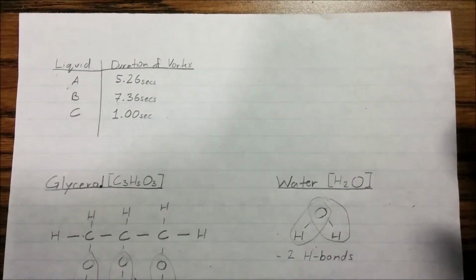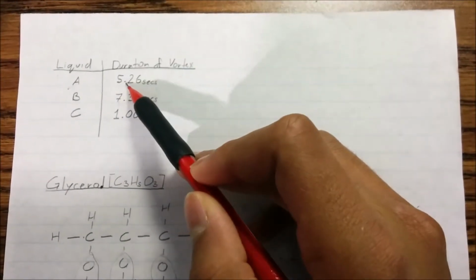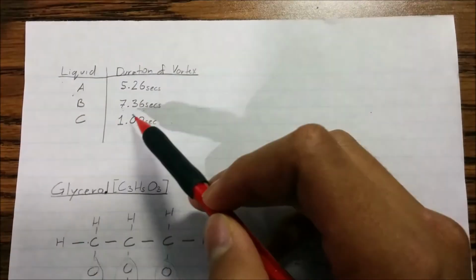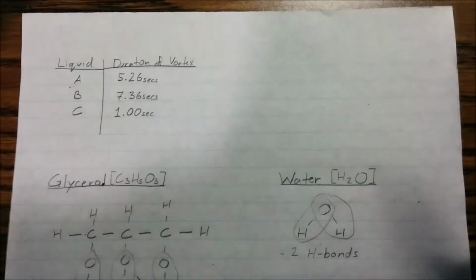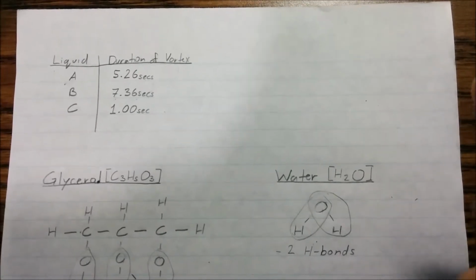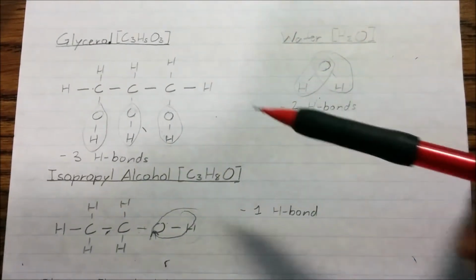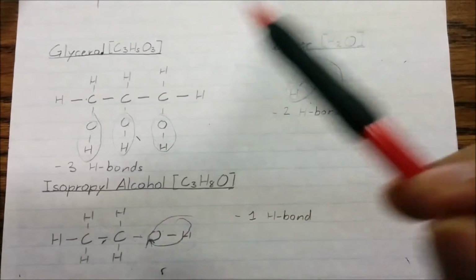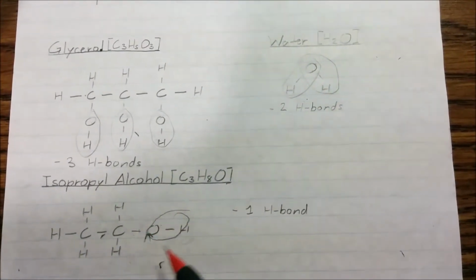Throughout the experiment, we found that when we timed the duration of the vortex of each substance, substance A's vortex lasted for 5.26 seconds, while substance B's vortex lasted for 7.36 seconds, and finally, substance C's vortex lasted for 1 second. To determine which liquid corresponded to which flask, we look at the intermolecular forces and bonds. If we look at the structure for isopropyl alcohol, water, and glycerol, we can see that glycerol has the most hydrogen bonds with 3 sites, while water has 2 sites, and isopropyl alcohol has 1 site.